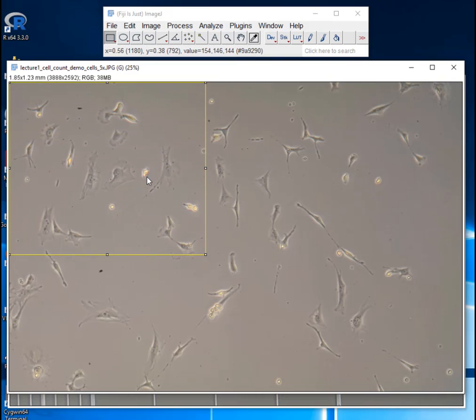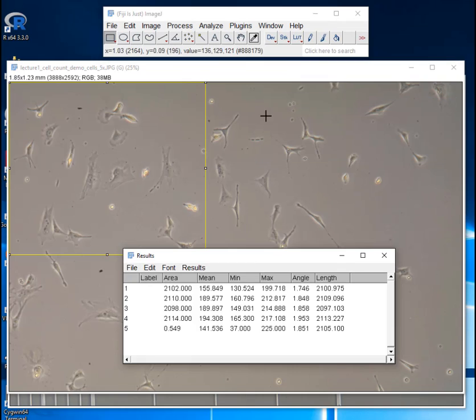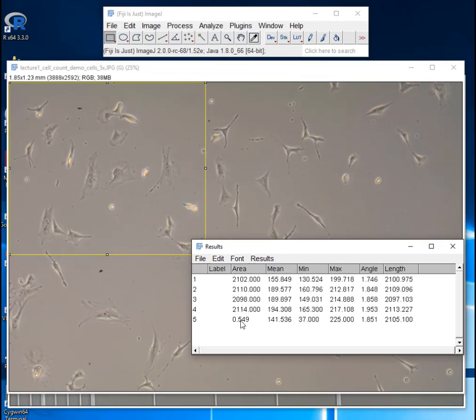And then I can measure the size of that rectangle by pressing Ctrl-M. If I bring up my results window again. Okay, it's this last one. And so you can see the area of that rectangle is 0.549 millimeters squared.